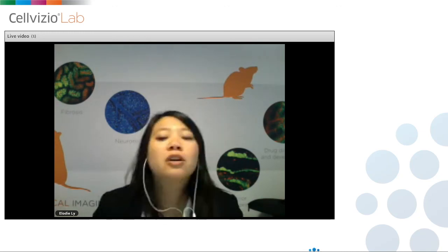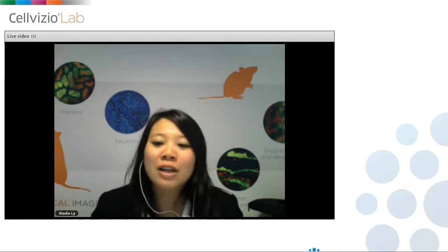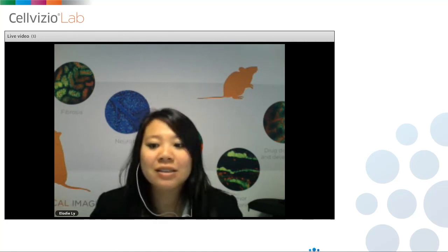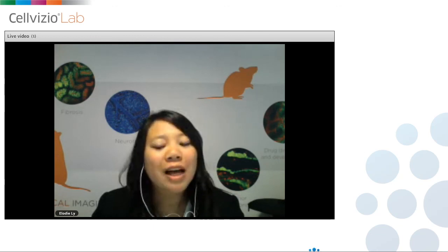And another question, I think it's more related to the experimental protocol. It is true that blood vessels have some dynamics and some movement. How can we compensate for that? It is in the analysis, the way you will analyze the data.